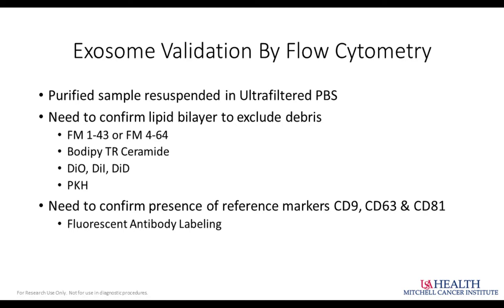The big problem with these two kinds of dyes is that you require multiple washes to get rid of all of the excess dye. They're really kind of a pain to deal with. It's what we started with. We started with the PKH, and one of my students was reading through a paper and saw the reference to the FM1-43, and we ordered it and tried it, and it was like, okay, never again. So that's where we stand. We believe that's probably your best choice, but there are many options there.